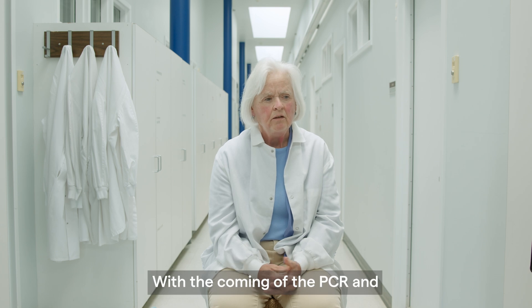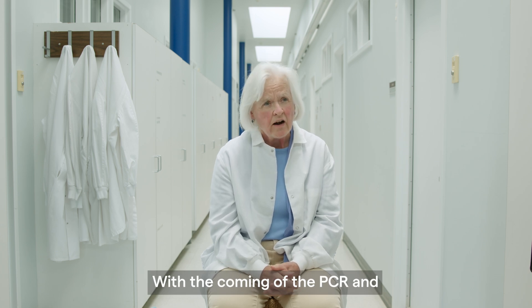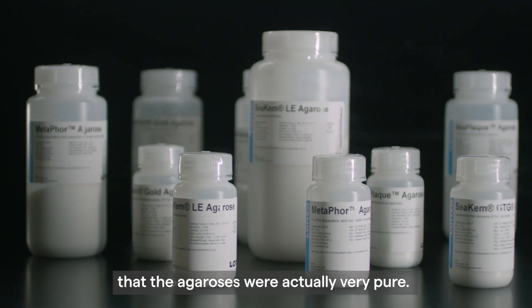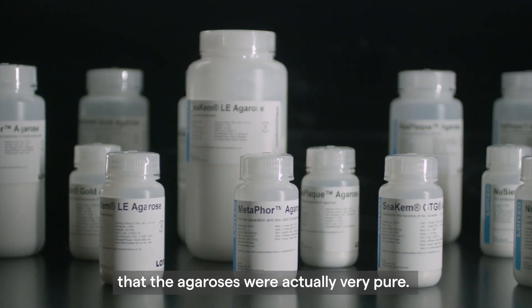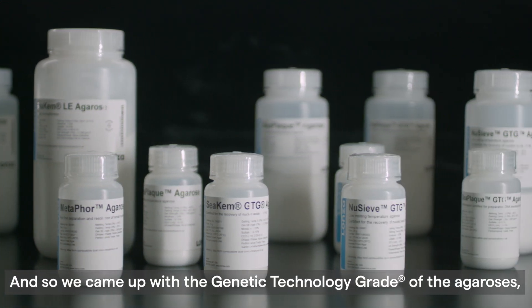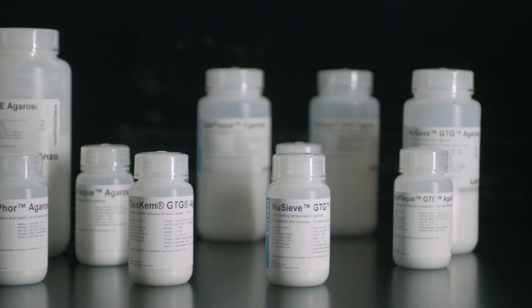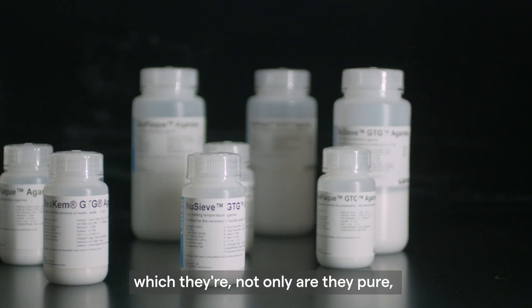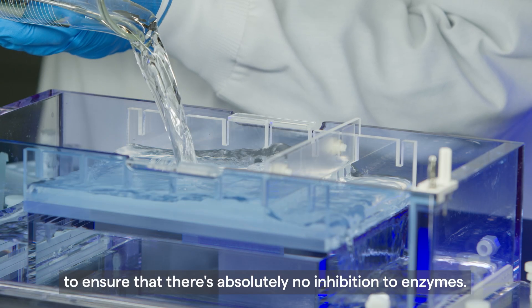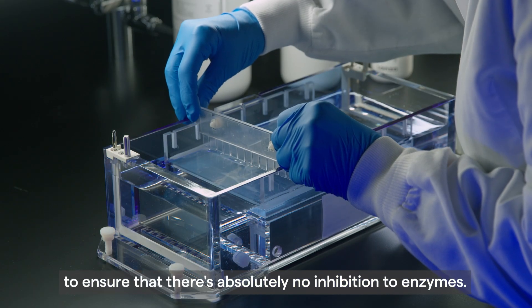With the coming of PCR and the human genome project, it became essential to make sure that the agaroses were actually very pure. So we came up with the genetic technology grade of agaroses, which are not only pure but are also quality tested to ensure that there's absolutely no inhibition to enzymes.